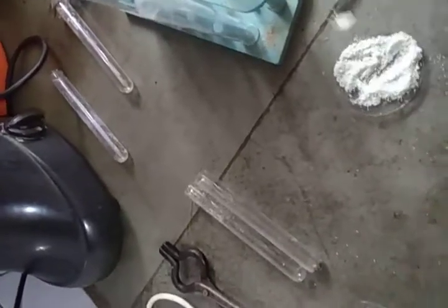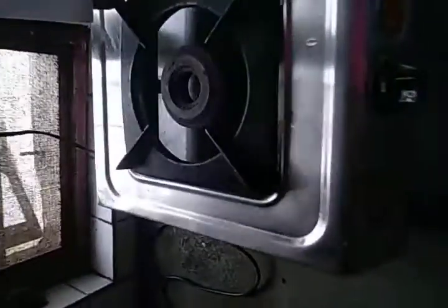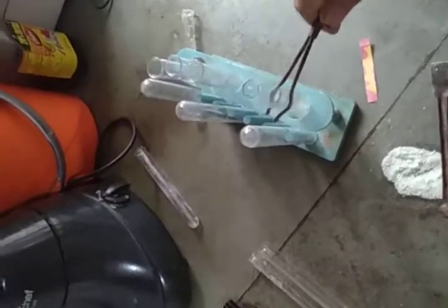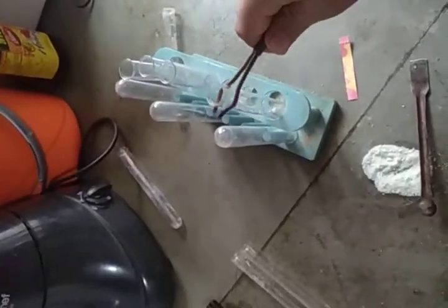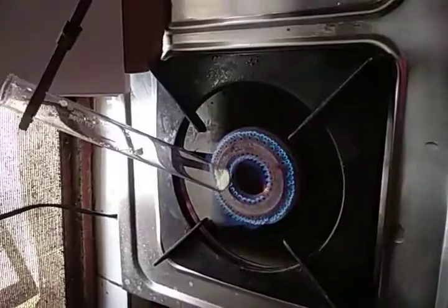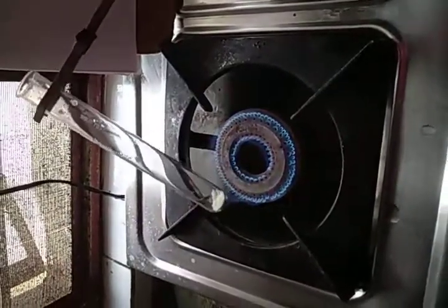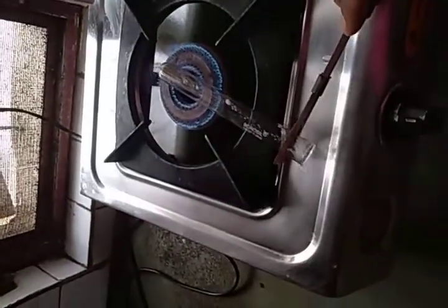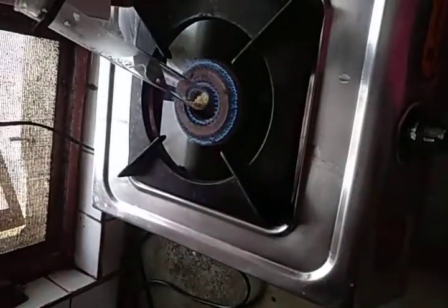You can see the crystals going inside the test tube. Now I'm going to ignite the gas cylinder and I'm going to put this test tube with the help of the test tube holder, and then I'm going to heat it.